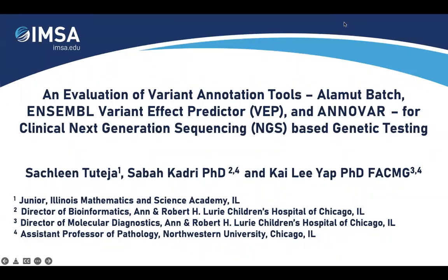Hello, everyone. I'm Sachleen Tuteja, and I greatly appreciate this opportunity to present my research work, where I evaluated the performance of variant annotation tools used in the clinical bioinformatics pipeline for genomic testing.